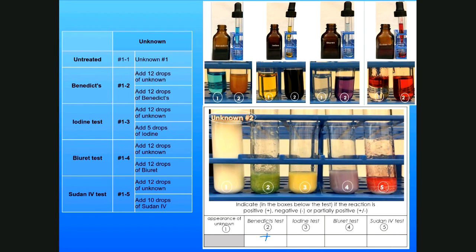Plus, the iodine test, there's not starch in here, but it looks like there's protein in here. And this one does not really show a complete layer. This is throughout. It got mixed, and this is mixed throughout. So what do you think this could possibly be? Something that looks white, that has a sugar of some sort in it, a reducing sugar of some sort.